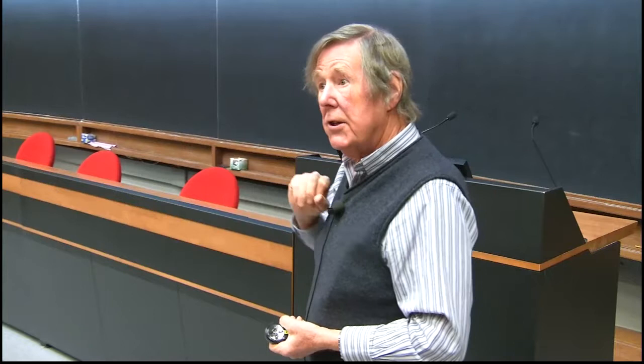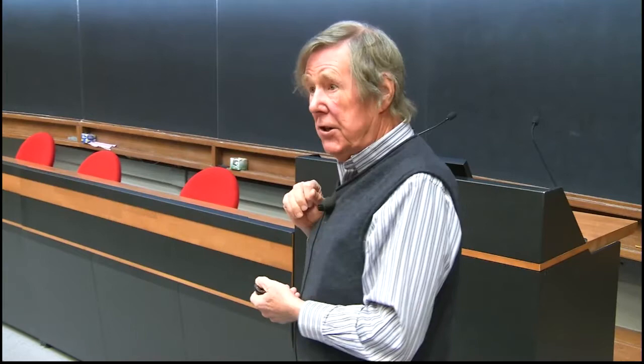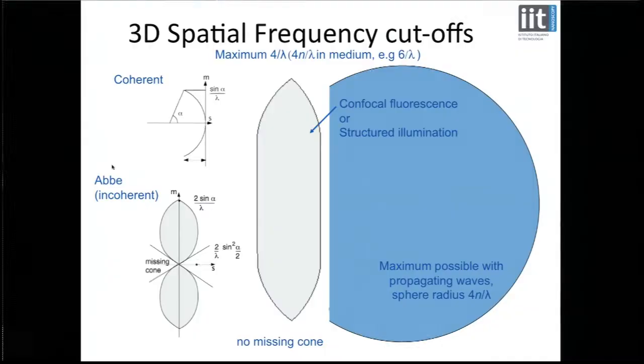This is what it does to the transfer function. So I start with this one, and this is actually showing the 3D transfer function. I haven't said anything about 3D imaging, but this is what happens. In a coherent system, the spatial frequencies you can pick up lie on the surface of this cap of a sphere in spatial frequency space.